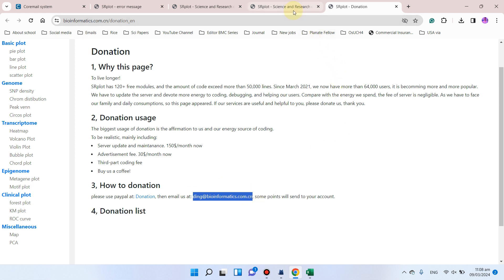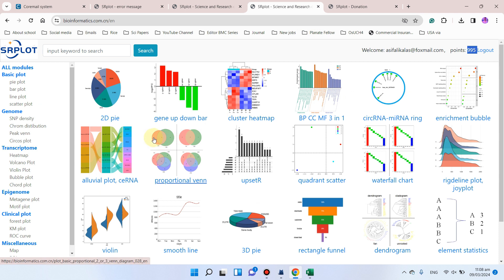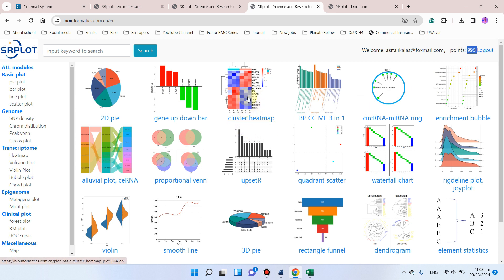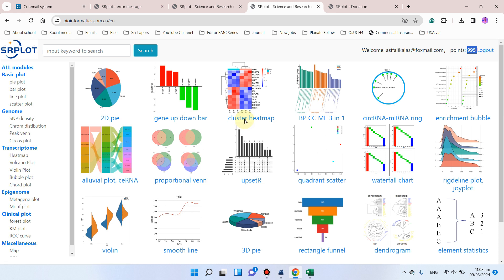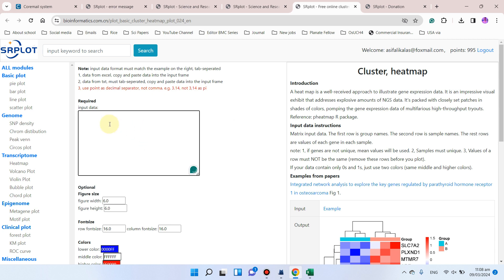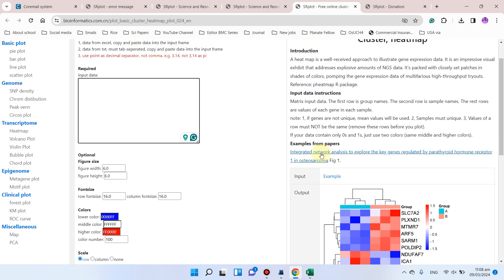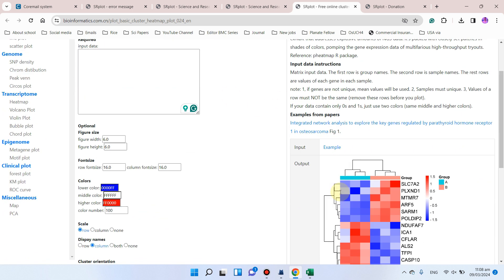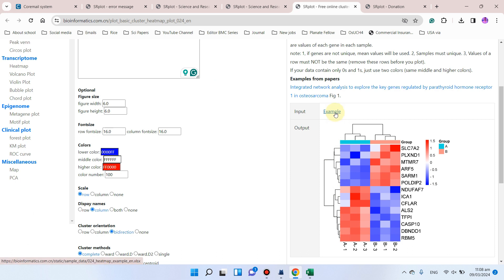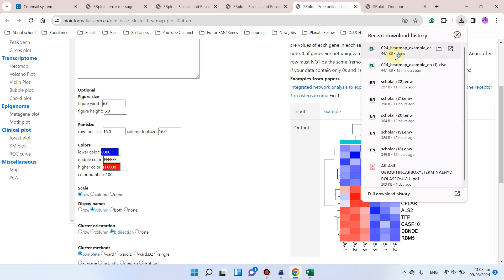Next are the common errors which occur during data formatting. Whatever analysis you want to choose after you have logged in — and once you have enough points — let's say you want to perform an analysis like 2D pi, gene up-down bar, cluster heatmap, or whatever you want. You can click on that analysis, then go to the input example to see the required data format.